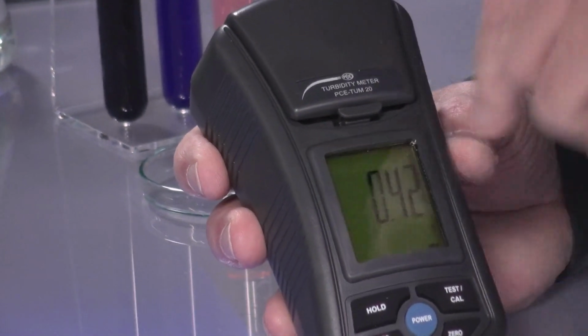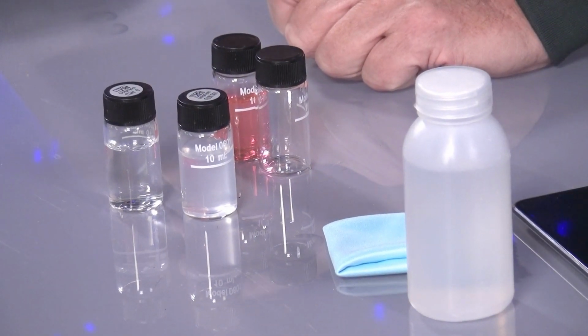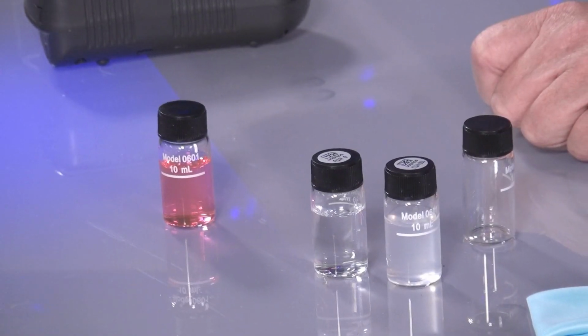You can, but you don't need to do the calibration before the next measurement. You can simply do it at certain times. When the device was turned off for a long time, it is sensible. Important is also that the bottles are clean. There is a cleaning fluid delivered with it, and a cloth with which you can clean it all, so that no dirt is inside. Infrared is used so that you can measure colored fluids. Because the color, for example red, doesn't matter, since in the infrared area colors are irrelevant and only the cloudiness is measured.